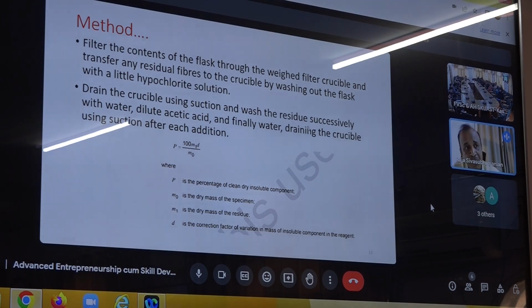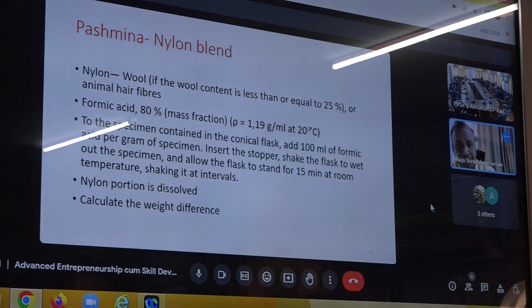So instead of sodium hypochlorite, you can take lithium hypochlorite. Lithium hypochlorite is solid, and its chlorine content stays at a fixed percentage. So whenever you want, you can dissolve it at the same concentration and use it, so that there won't be any false reading in this.